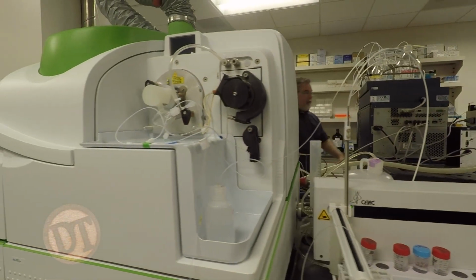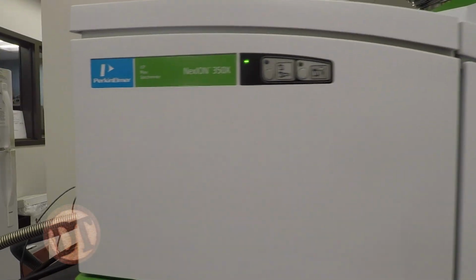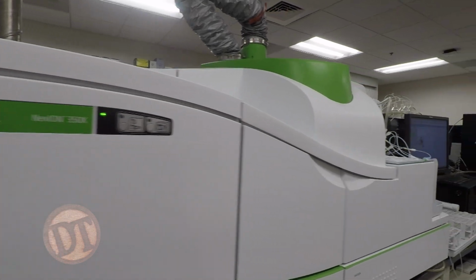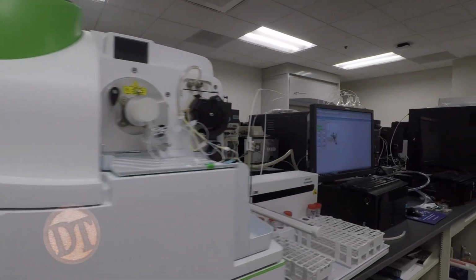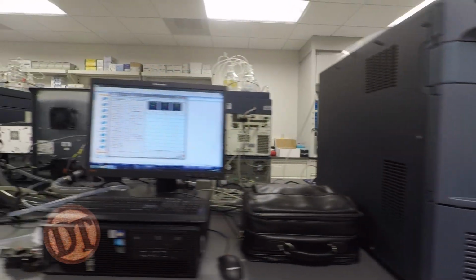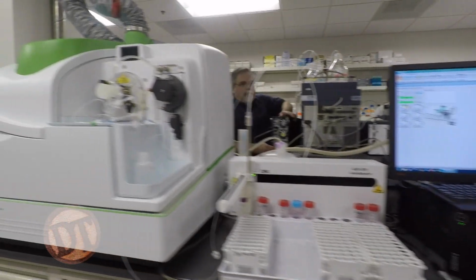So do you generally do like a panel then of minerals and I assume vitamins? Right. Well, the machine we use will look at 26 different minerals, and we can look at all 26 of those all at one time. That's the beauty of these machines. With one sample, it takes about a minute to run 26 minerals, and it used to be we'd have to do those one at a time, and now we can do them very rapidly.